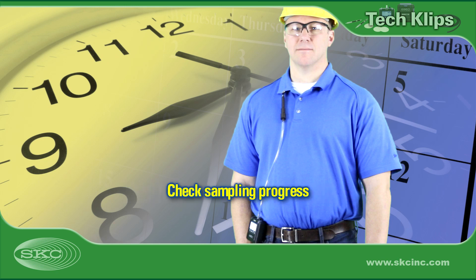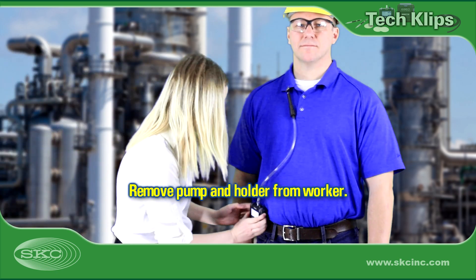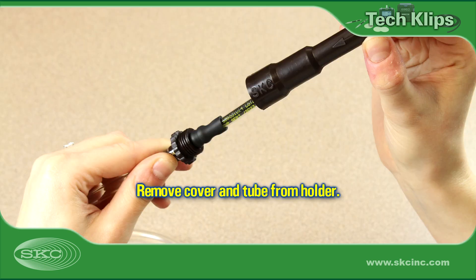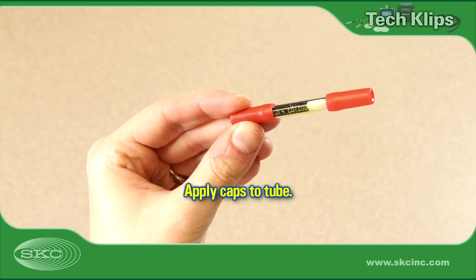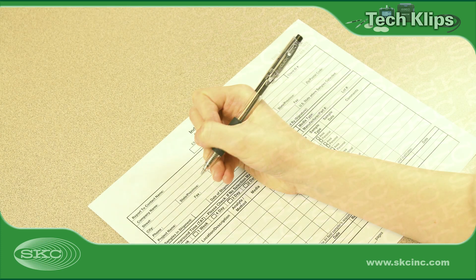Sample for the length of time required to obtain the method-specified sample volume. Sampling times may vary for analytical reasons, so check the method and with your lab. Periodically check sampling progress. Prepare blanks, which are sorbent tubes of the same model and lot as the sample tube — break off the ends, but do not draw air through these blanks. Stop the pump run. Note sample stop time and remove the sampling train from the worker. Unthread the tube cover from the holder, pull the tube from its sleeve, and apply a supplied cap to each end of the tube.